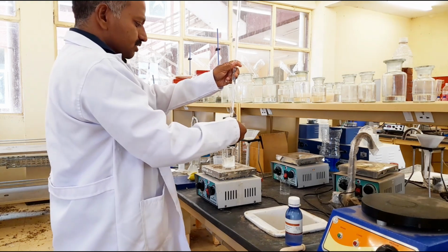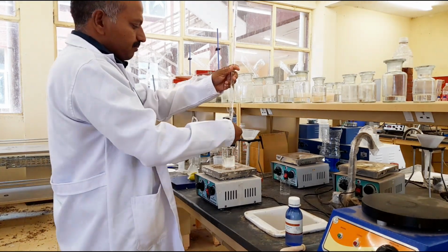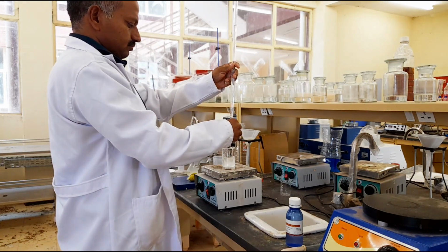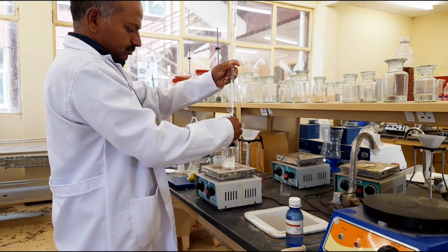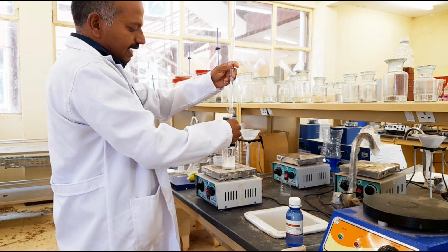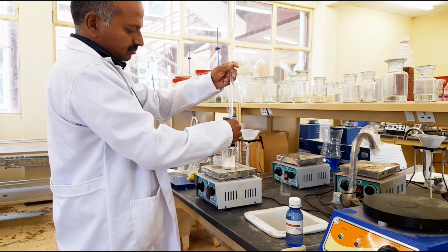Carefully observe the color change. Now it is colorless; it converts into pink color in the basic medium. Slowly, 0.1 molar sodium hydroxide is reacting with the lemon juice containing citric acid.